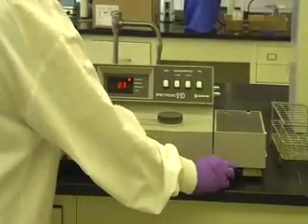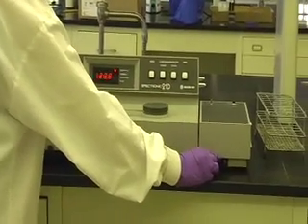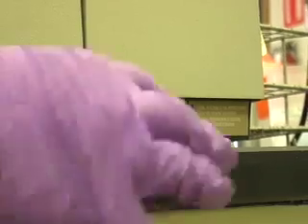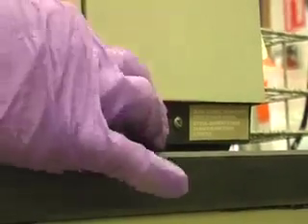Use the mirror lever on the bottom right of the machine to adjust the mirror to the position required for the lamp. Pull the lever out to use the deuterium lamp for UV wavelengths. Push the lever in to use the tungsten lamp for visible wavelengths.